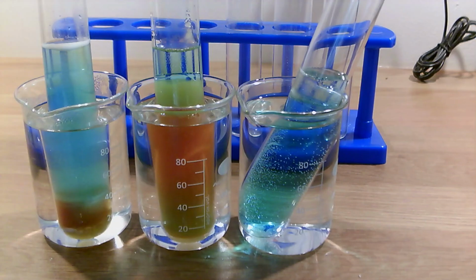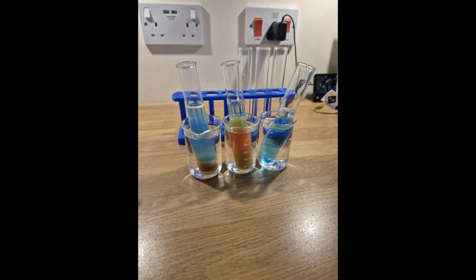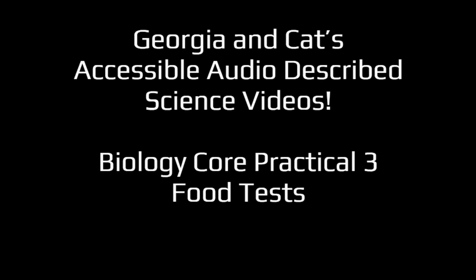The positive test for lots of glucose is brick red, but any colour change shows glucose is present. This means the jelly baby and honey both contained glucose, but the pasta, cheese, oil, milk and sugar don't contain glucose.